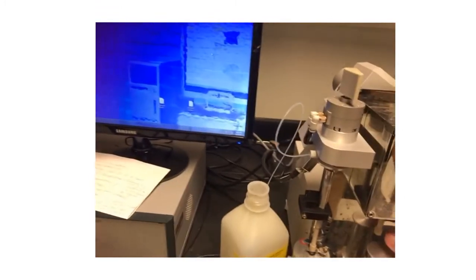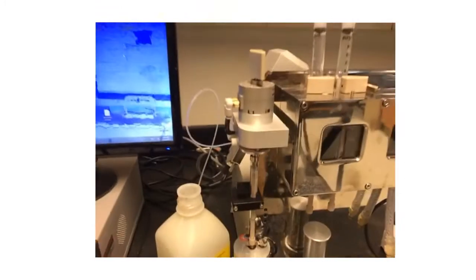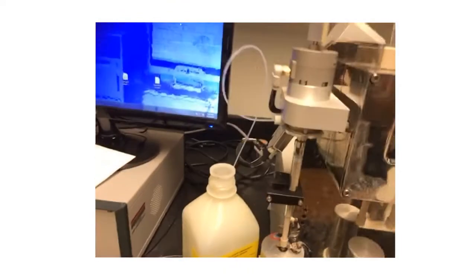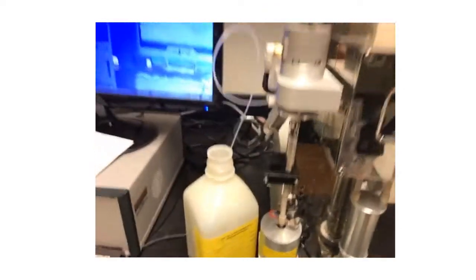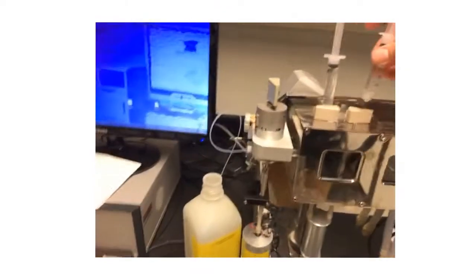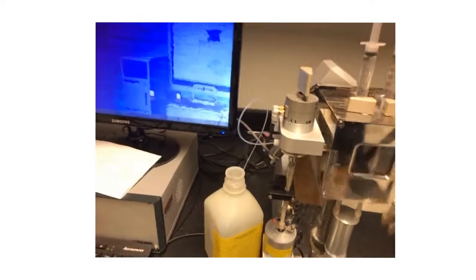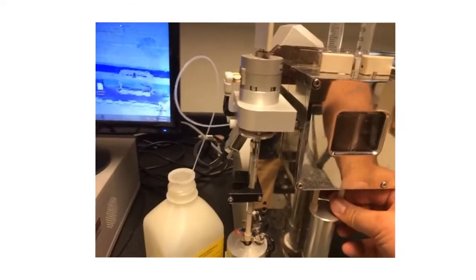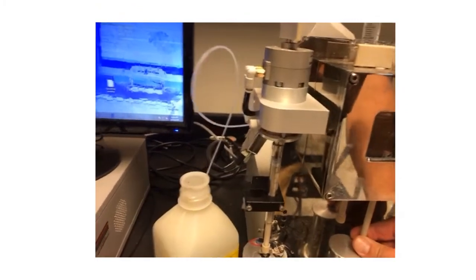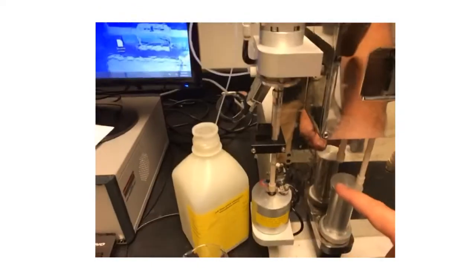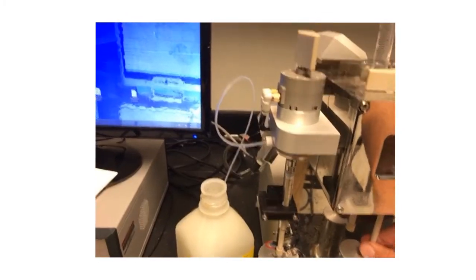And then, so if we're switching out, we would just simply remove whatever reagents were that were added in. This plunger here, the bottom plunger would be all the way up in this case. And we just simply unscrew, swap, add our new reagent in, screw into place, and then just lower until that plunger hits the bottom. So you just want to fully load your reagent onto the system.